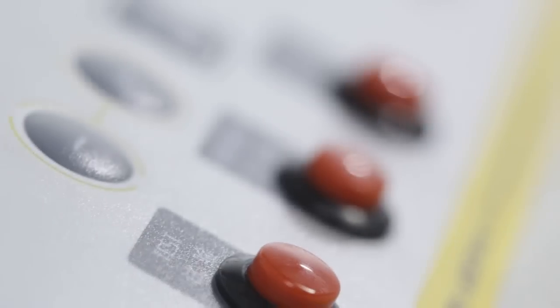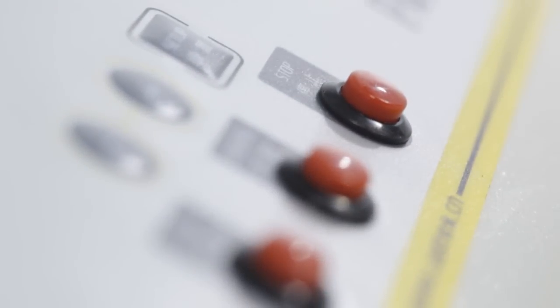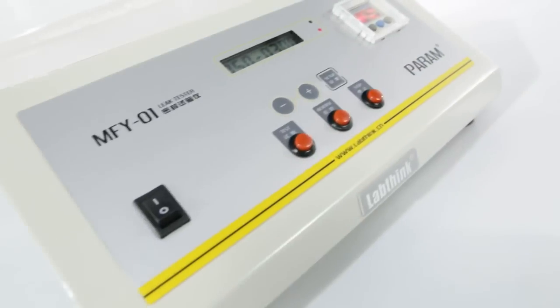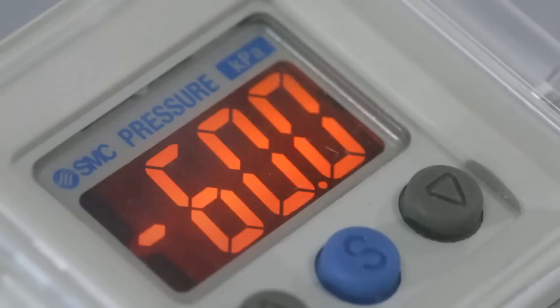This entire process is monitored and controlled by high precision manometer and microcomputer. This instrument allows presetting of vacuum degree and vacuum retention time.